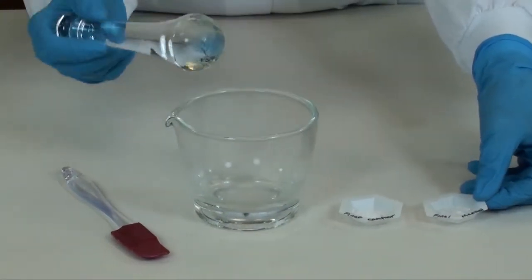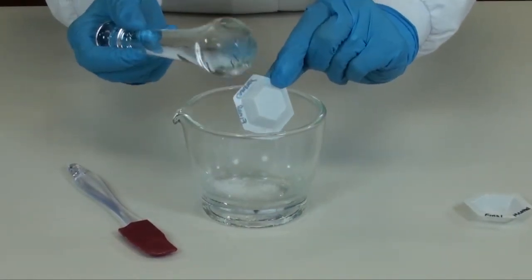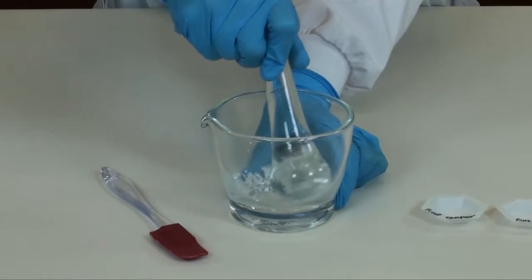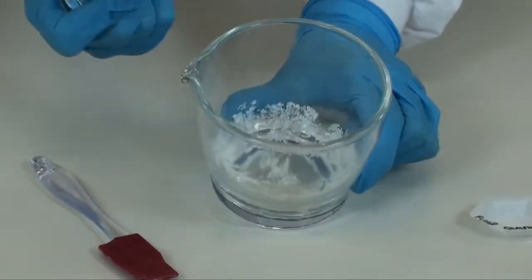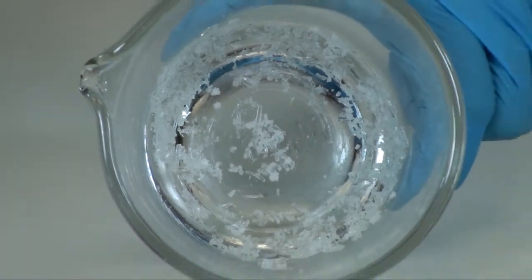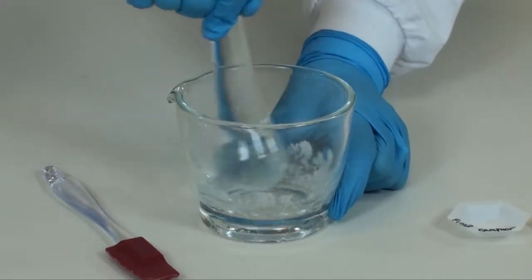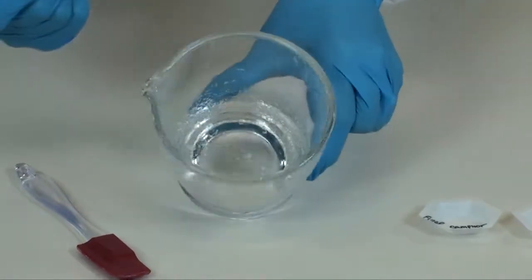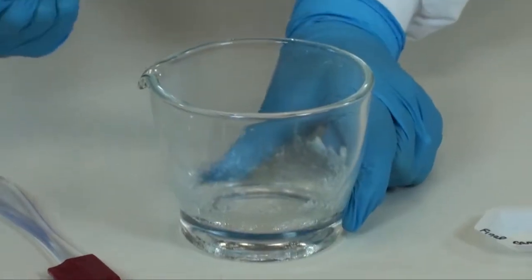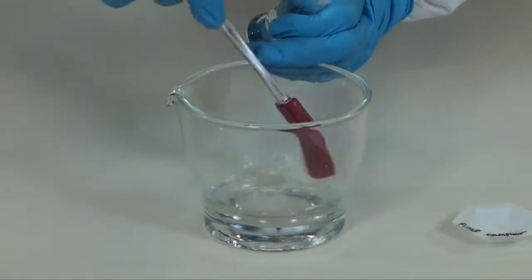Place the menthol and the camphor in the glass mortar, and triturate to form the eutectic. Continue to triturate, it will become damp. Scrape down the sides if you need to get the drug back into the center of the mortar.